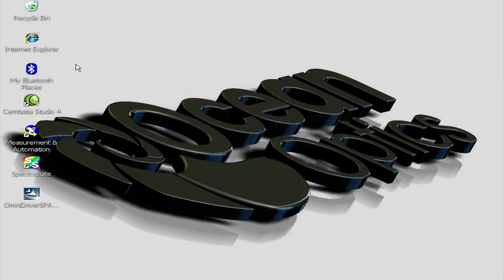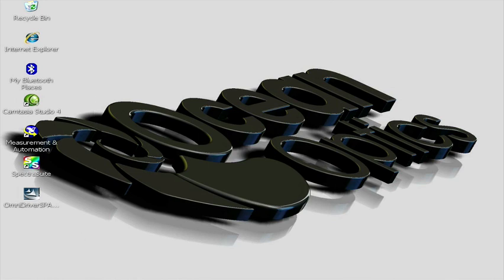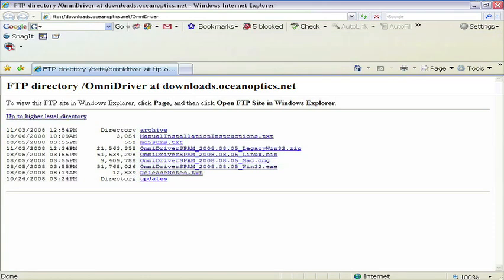To start, we'll have to install the Omni Driver application. To download the installer, open your internet browser and navigate to the FTP address. Click on the link for the appropriate installer for your operating system.